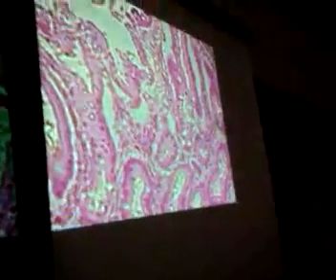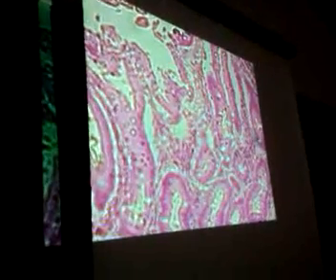Now up here, look at this. I might have to change the lighting a dab. Sometimes your scopes are actually better than this one, a little easier to use. All right, but what I want to show you on this is, what do you suppose? Let's see if we can focus somewhat.